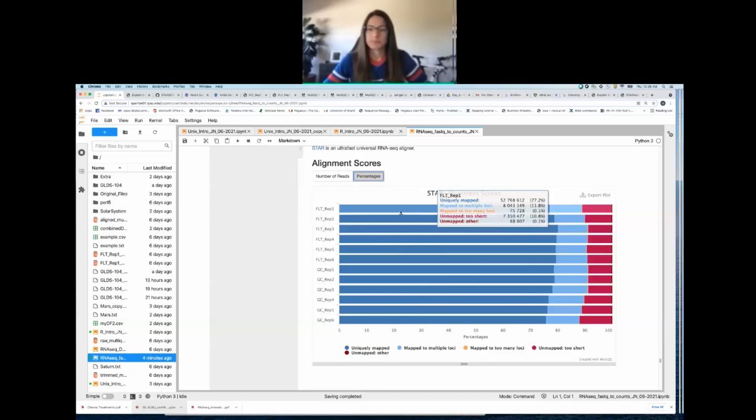You think that looks good? You think that it should be tighter? What are you guys thinking about that? Yeah, smaller spread is always going to be better, but 4 to 5% handily, I think that's pretty good too. So yeah, these are all pretty close to the percent of total that were mapped. So that's nice. That tells me that's pretty consistent data, which is nice.